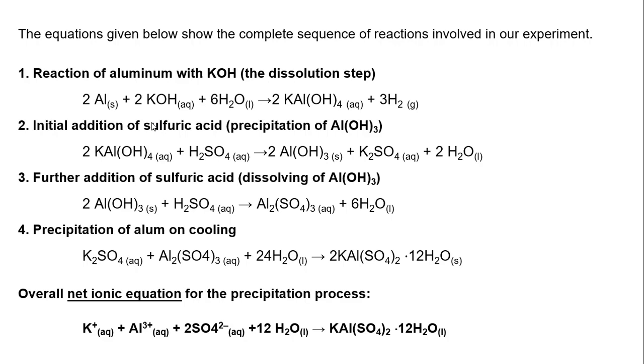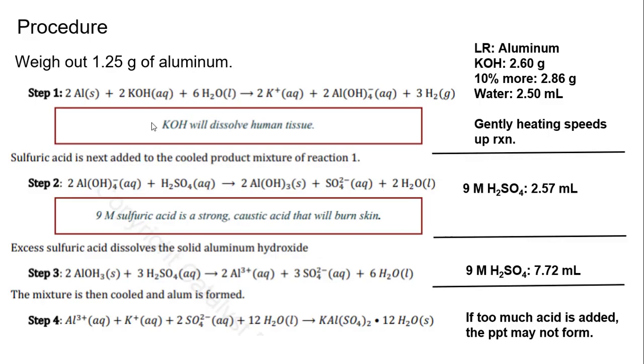So here's the overall net ionic equation that's at the bottom. All right, so I'm going to go through the procedures because LabFlow did not really produce procedures here. And I'm not a big fan of how this lab was written. I know what they're trying to do. They're trying to make you do a cost analysis. We'll cover all that later. So in this lab, I'm giving you what would probably have been given in the procedures had they given you correct procedures.